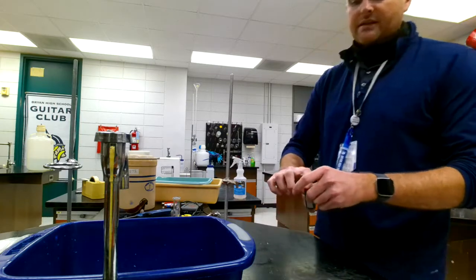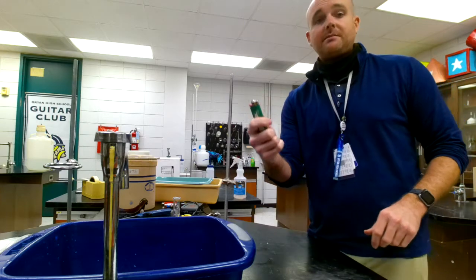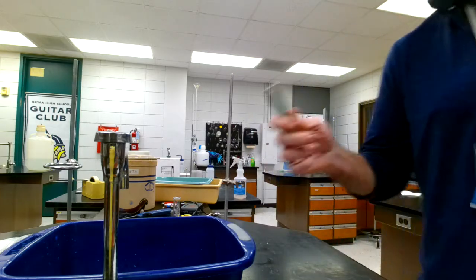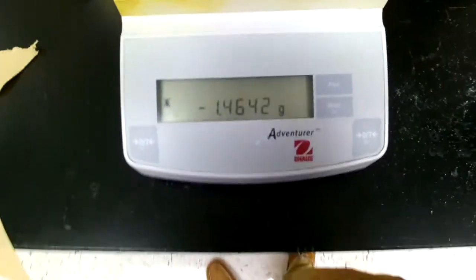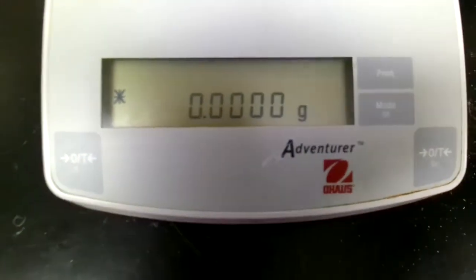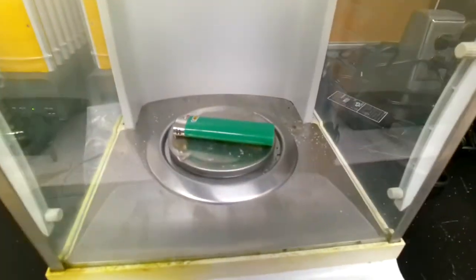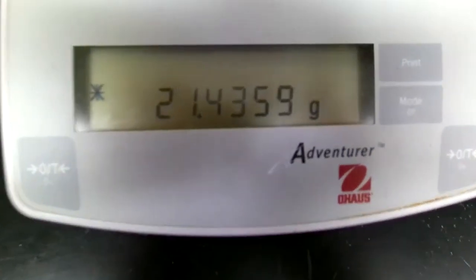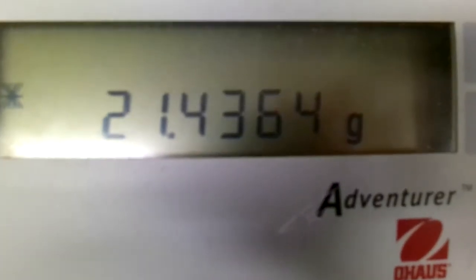So we're going to take this lighter and make sure it does light. It does have some gas in it. Then join me over here. We're going to find the mass of the lighter straight away. You see I placed the lighter on the balance, and then we're going to check it out. 21.4364.